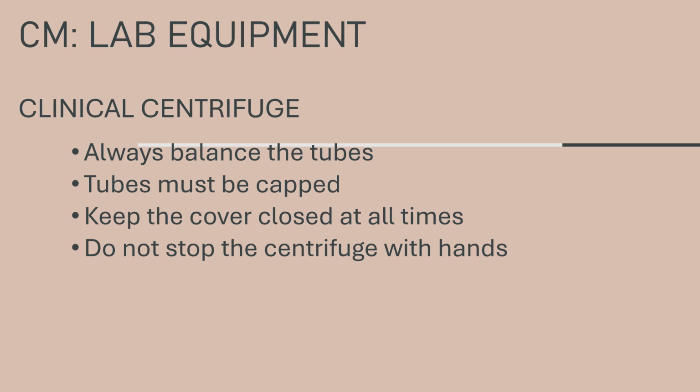That is why, before centrifugation, you make sure that you balance the tubes. If you only have one, or an odd number of tubes, make use of an extra tube filled with water.